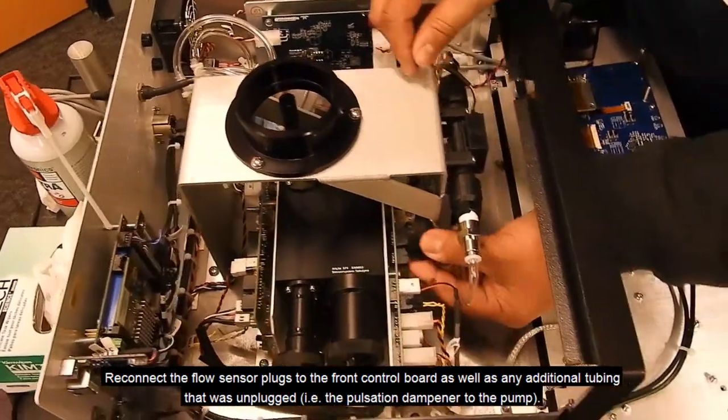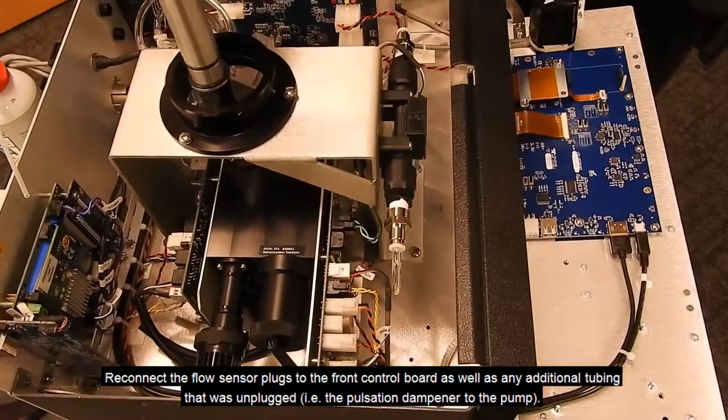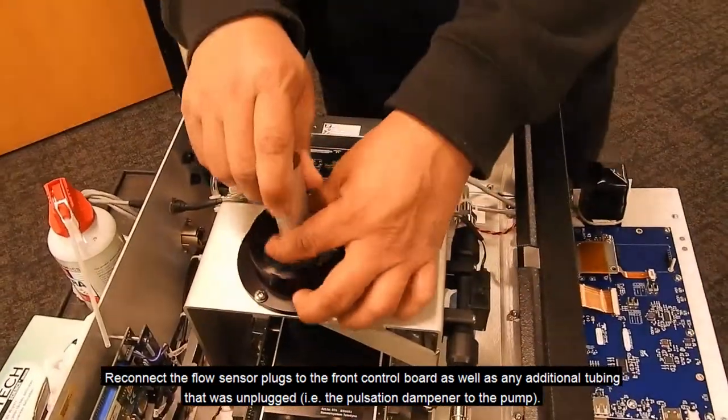Reconnect the flow sensor plugs to the front control board, as well as any additional tubing that was unplugged, such as the pulsation dampener to the pump.